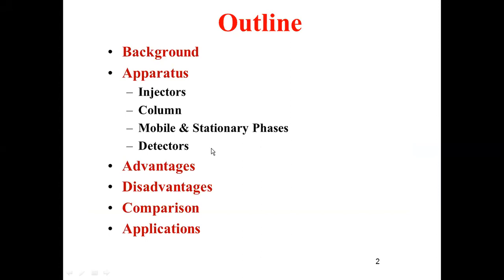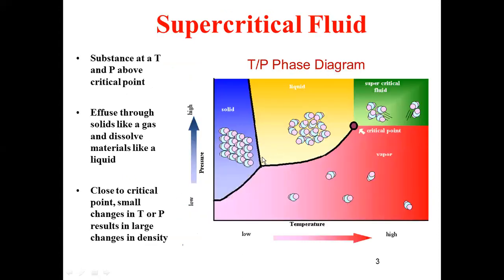And what are the advantages of supercritical fluid chromatographic technique? And what are the disadvantages? How can we compare the performance characteristics of supercritical fluid chromatography with HPLC and GC? And what are the relevant applications of supercritical fluid chromatography? Let us discuss one by one.